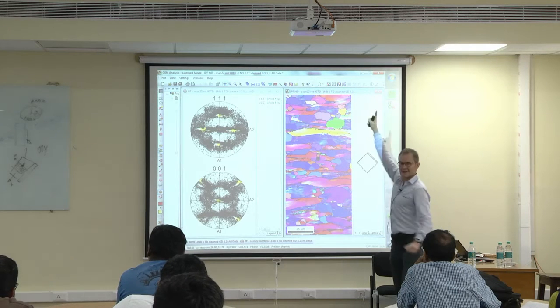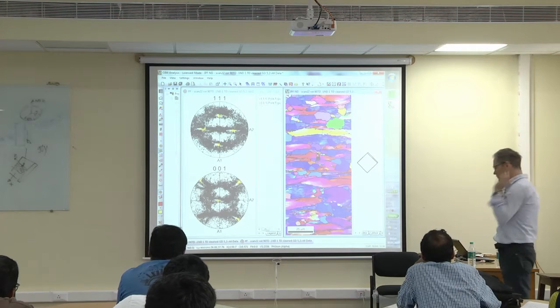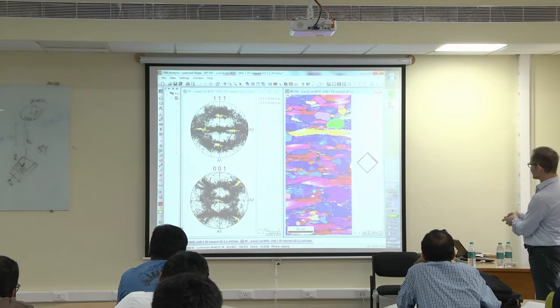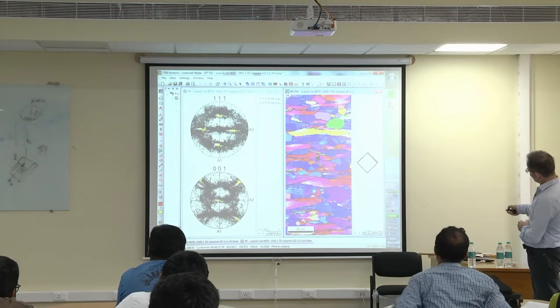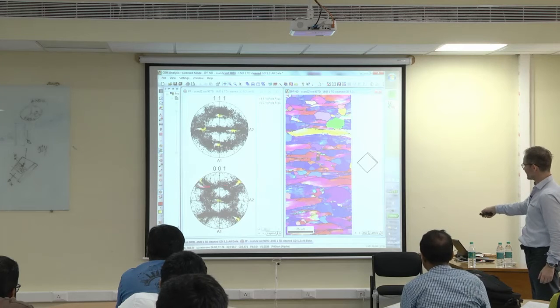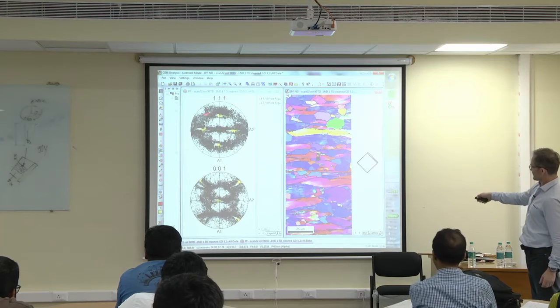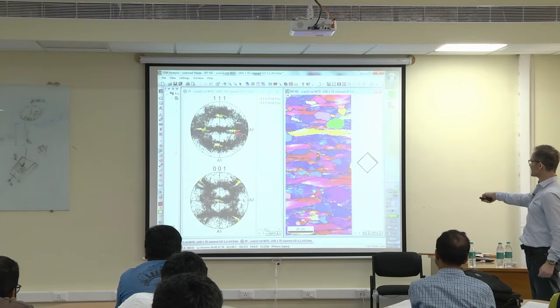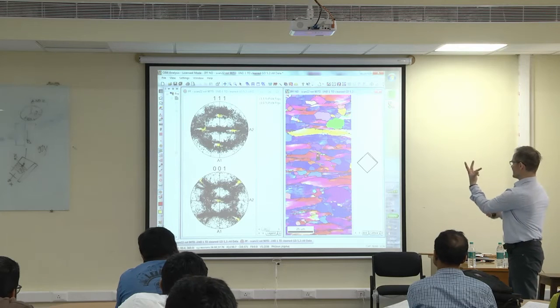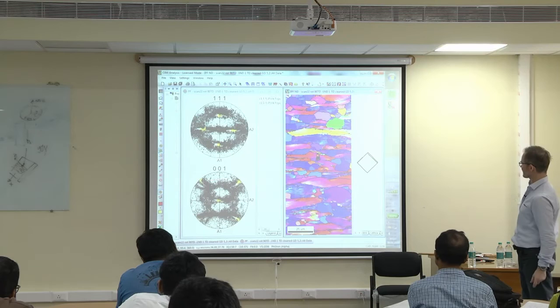It's not pointing out, it's pointing up, because we have rotated the data. But okay, if we consider that, then everything is good. And actually, the other 001s, this is quite an interesting grain. It's really standing under 45 degree. That means it's exactly fulfilling here at 45 degree these corners here. And so it's a very highly symmetric orientation which we have here. These are 4 111 corners and the 3 100 corners.